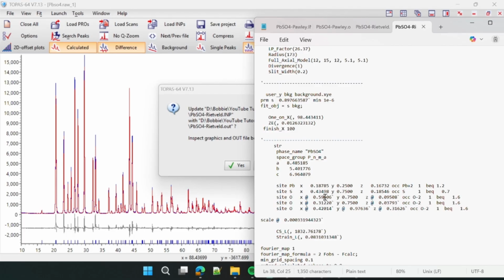So 5-9 to 5-9-6, that's okay. 9-5, that's fine.